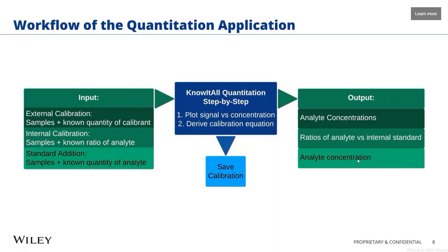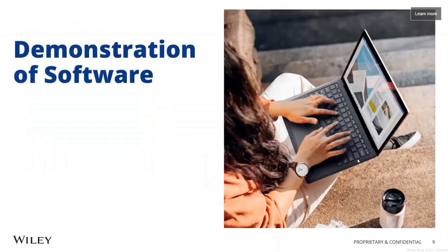And finally, if you're doing standard addition analysis, the data that you input would be samples and a known quantity of analyte. The data that's output is analyte concentration. And now I'm going to be switching over to KnowItAll to give a demonstration of the software.